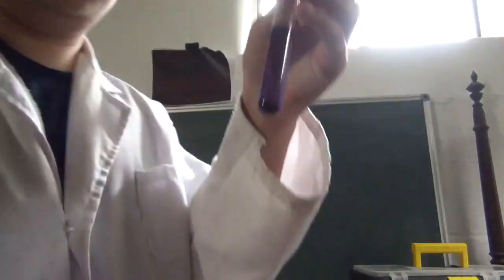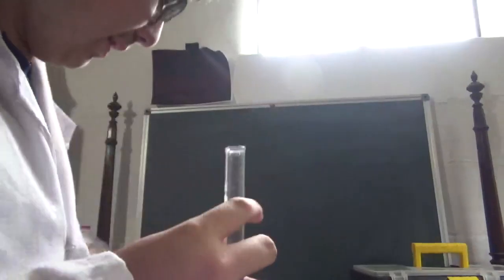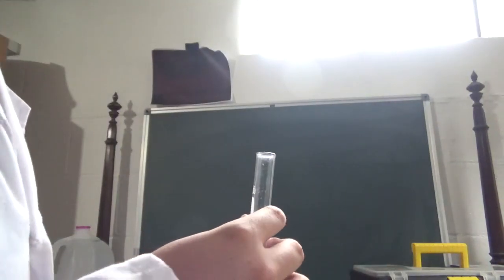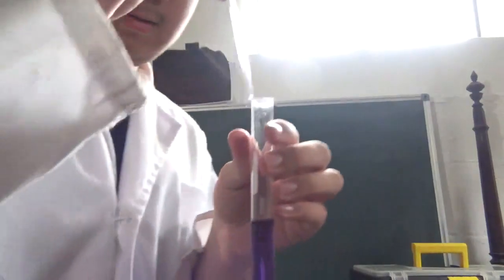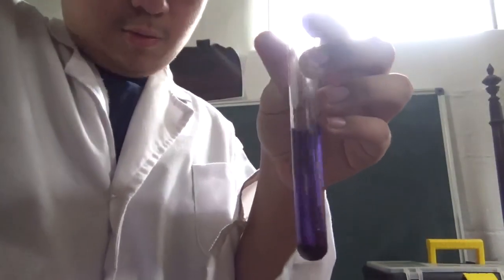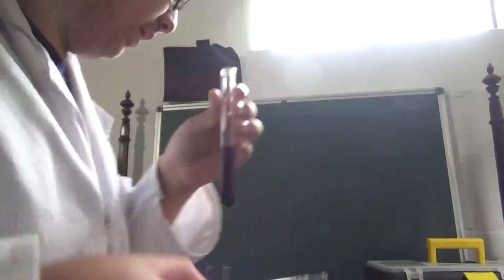So we're just going to throw in some powder here. And now we've got this bad boy, which is the litmus solution. I do not know the solubility of this in water, but we're just going to go with it. Now we're going to mix it in with this glass stirring rod just like so.